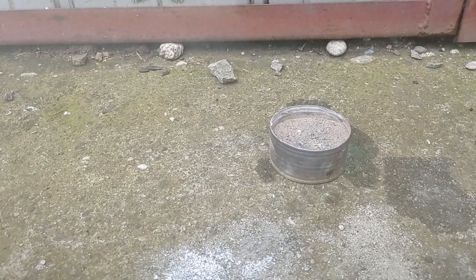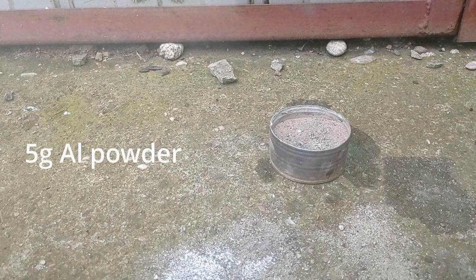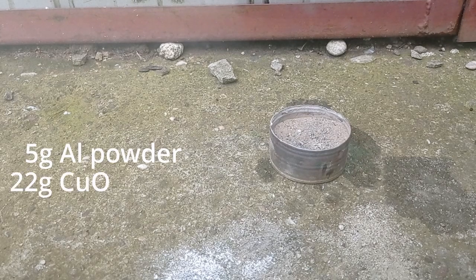Okay, and it's time for the last thermite. Again 5 grams of aluminum powder and 22 grams of copper oxide.